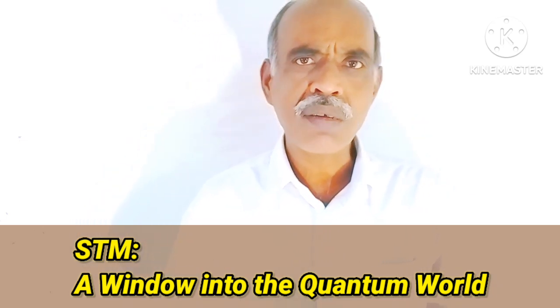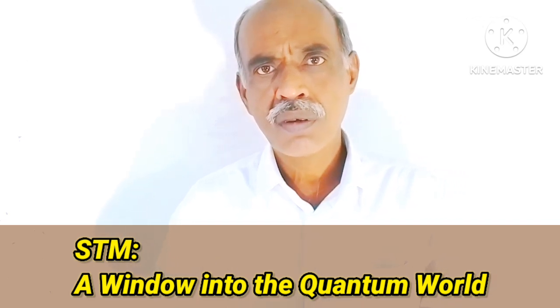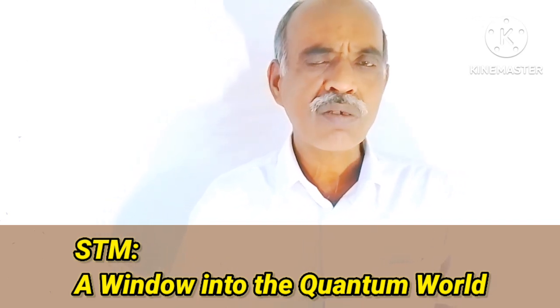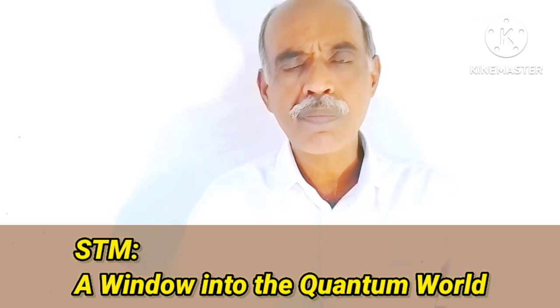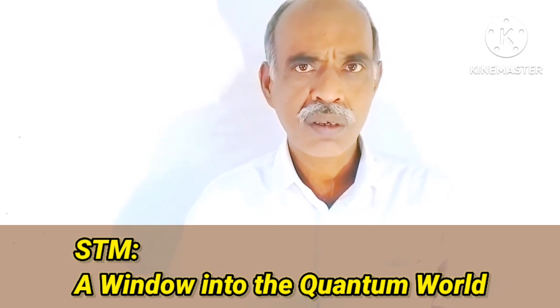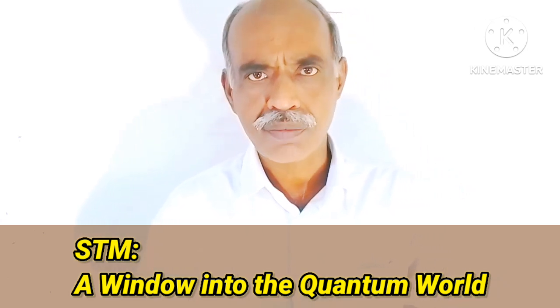Anyway, what is the working principle, how is this technology actually used? In this technology, a very thin and very sharp metal tip is used, usually made of tungsten or platinum iridium.